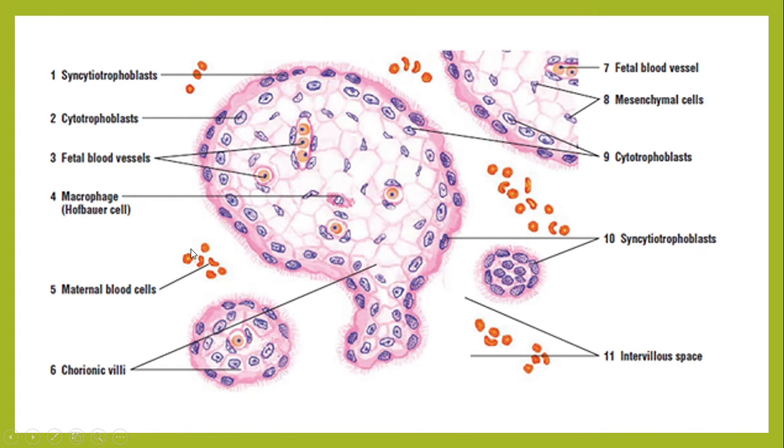In a single section of chorionic villi, you can see the darkly staining outer syncytial trophoblast, and a single layer of lightly staining cytotrophoblast inside. Can you see the two layered cells here? Yes, ma'am. This is the outer layer, the syncytial trophoblast, and the inner layer, the cytotrophoblast.